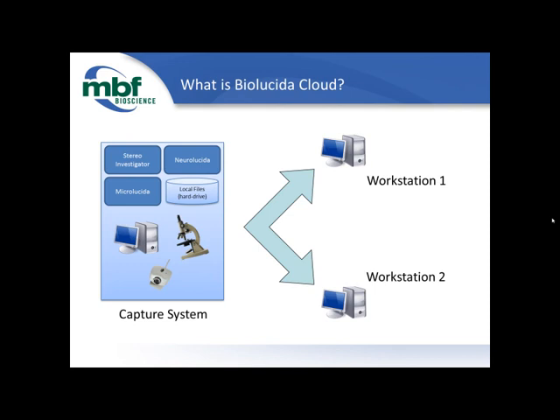All right, well, let's instead say that someone else had captured the images then, and they've left the lab, maybe moved on to a new postdoc. Sure. And now you've taken over the project, and it's your job to go through their data and find things. Yeah, and actually I've been in a similar situation before, and I know that having to search through directories of someone else's files to find what you're looking for is painful.